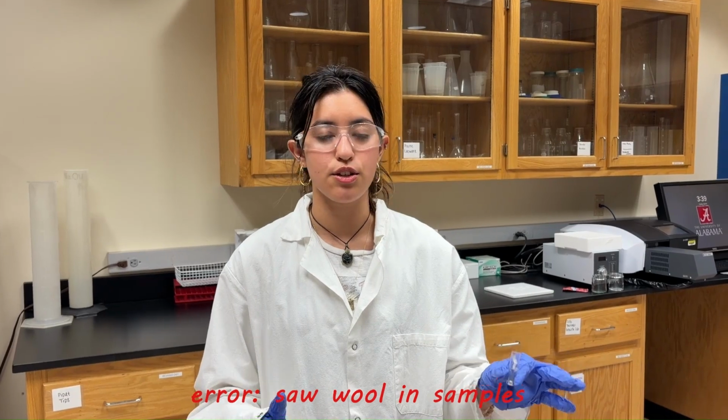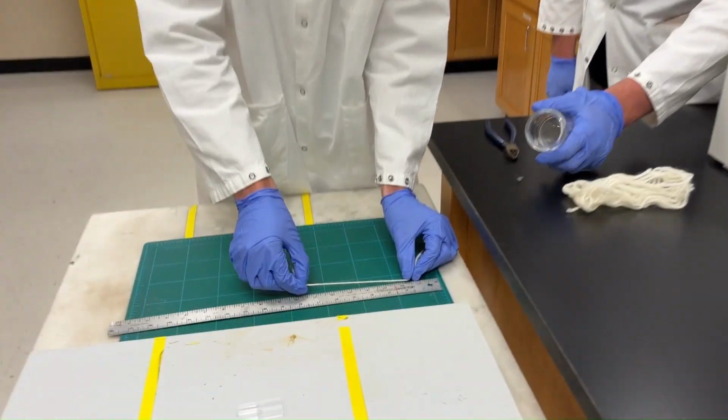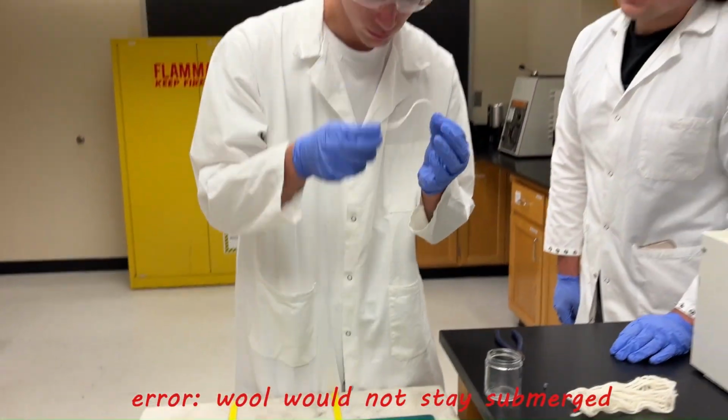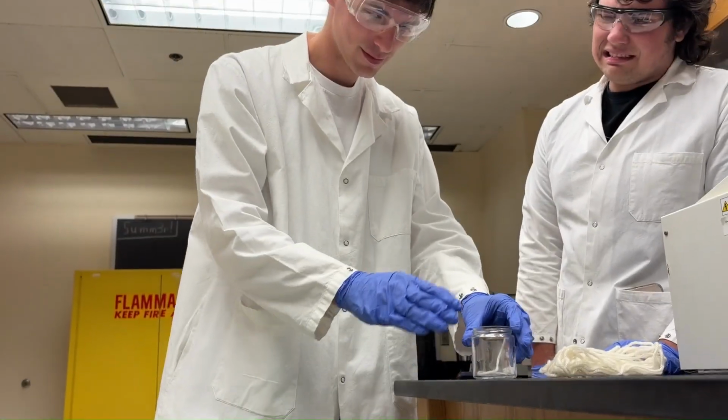Some of the errors we had was we saw a lot of wool in the cuvettes, so just be careful when you're pipetting them. Also, make sure the wool is fully submerged and perhaps consider using more string than just 6 inches to allow for more absorption.